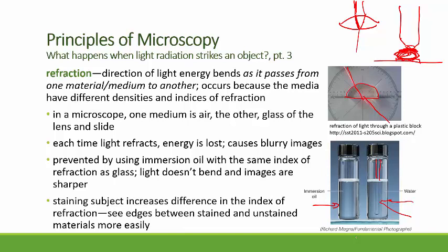And so this is another way, one of the points, I think the book makes this point, that you can smuggle diamonds in oils like this because it just looks like you have a little container of some oil. And the diamonds, because they have a similar refractive index to whatever the smuggling oil is, become invisible there in the bottom of the glass jar.